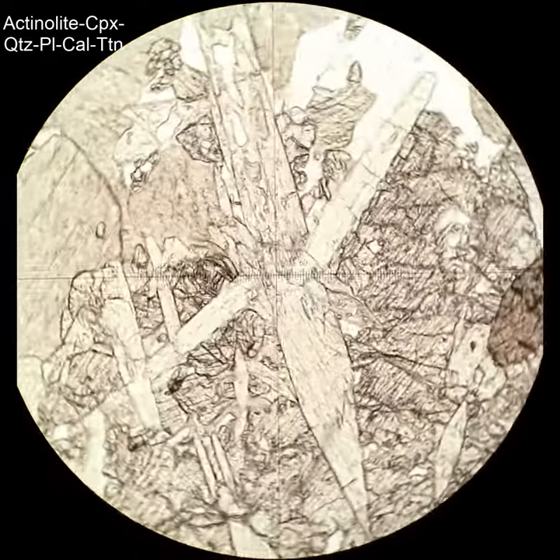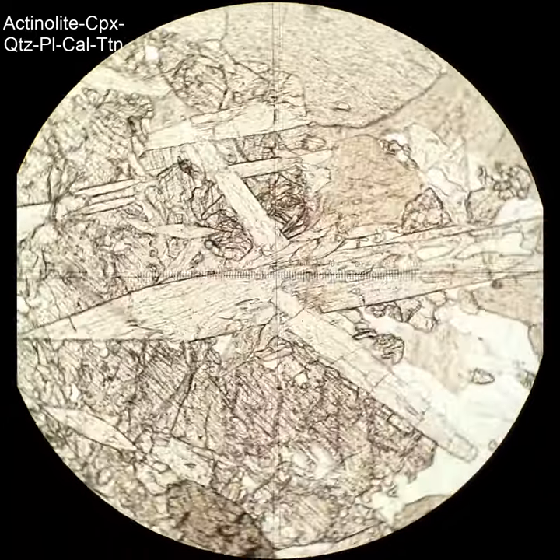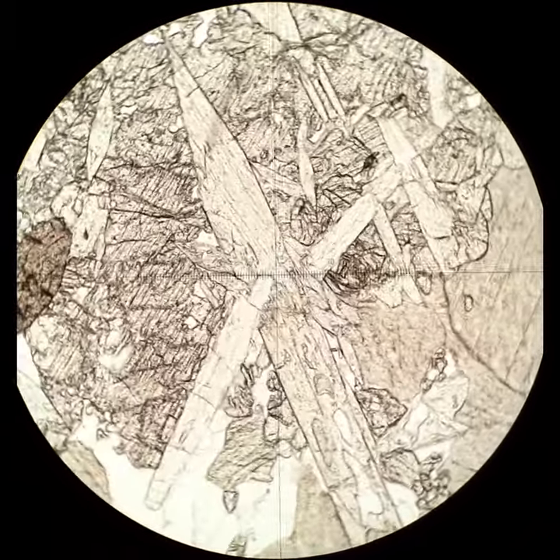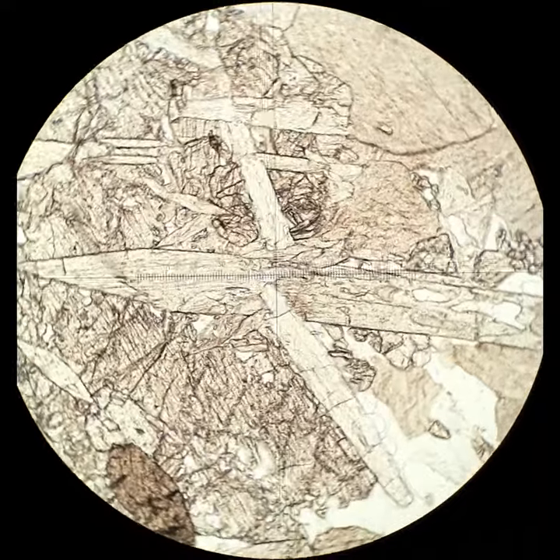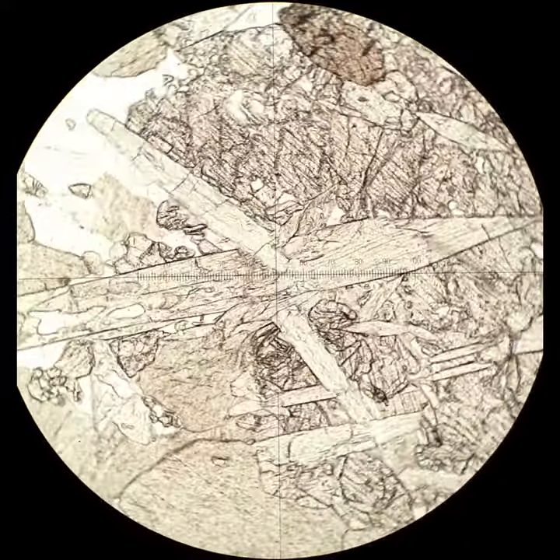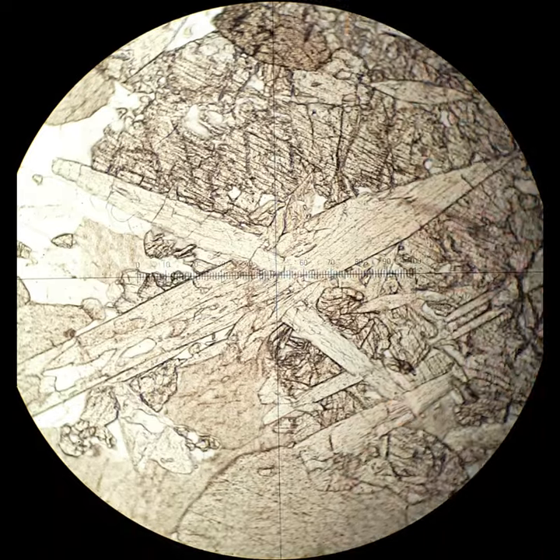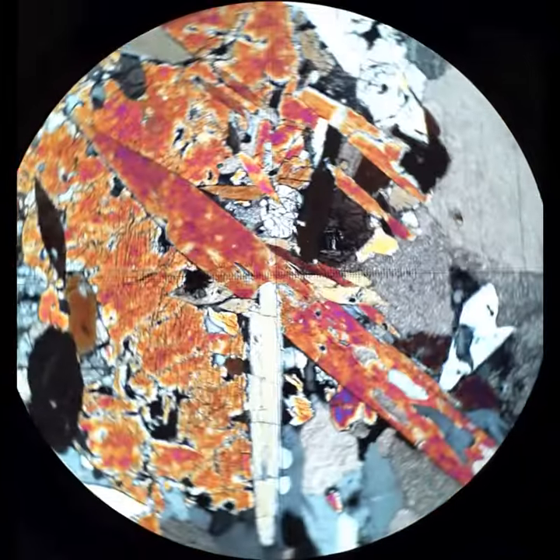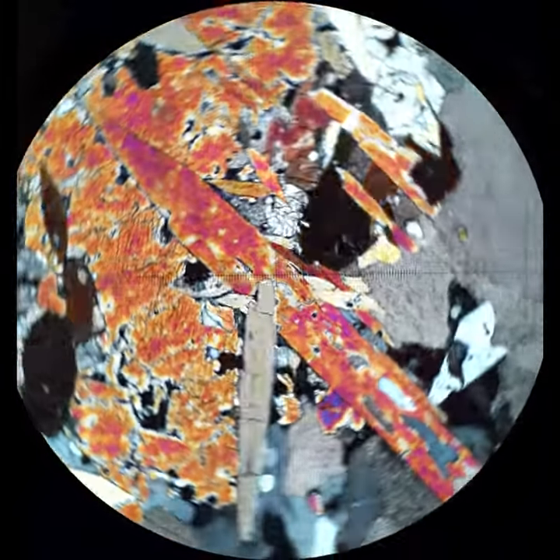Actinolite is the moderate relief crystals in the middle, sort of shaped a little like an airplane. They're up against higher relief clinopyroxene and even higher relief titanite that are now immediately to the north. Across the polars, it's that magenta orange and the airplane wings are that sort of yellowy white. Higher relief than quartz, which is in this section also in one side. It's comparable to calcite, but calcite, of course, has variable relief.